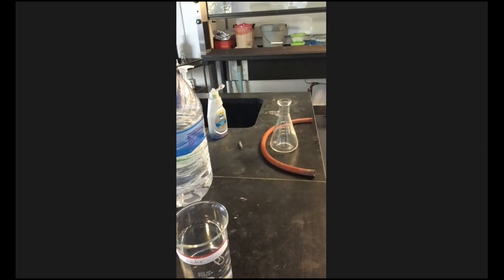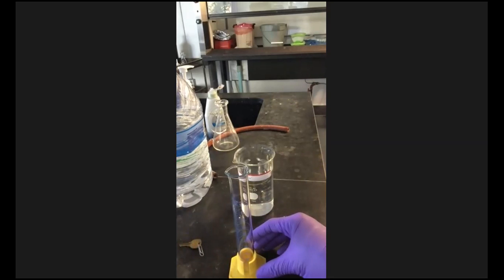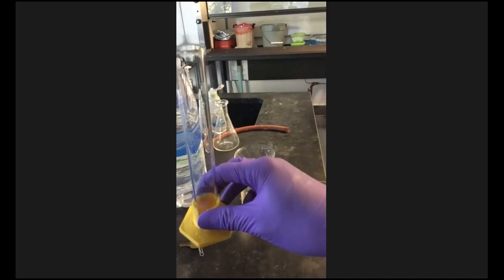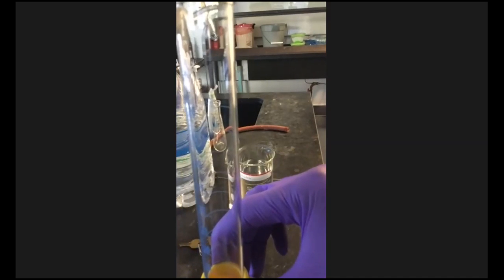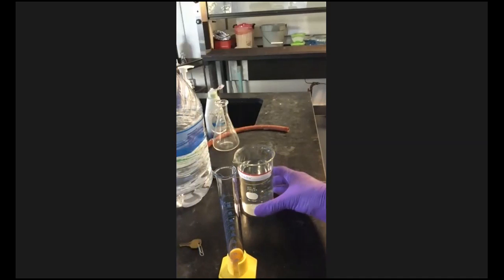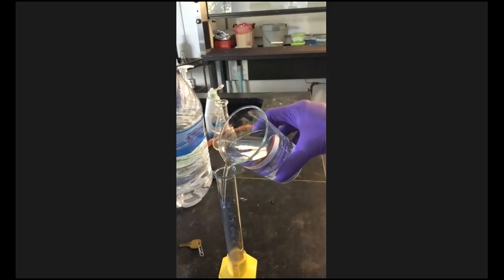And now we're going to take 150 milliliters of the water that we just measured out, and we're going to add that to that flask. So 150 mils. You can see here, I'm not going to eyeball that. I should have got a bigger graduated cylinder. So we're going to take a 50 mil graduated cylinder. You can see that top number. I'm going to just have to fill it up more than once. So I'm going to do 50 mils at a time.